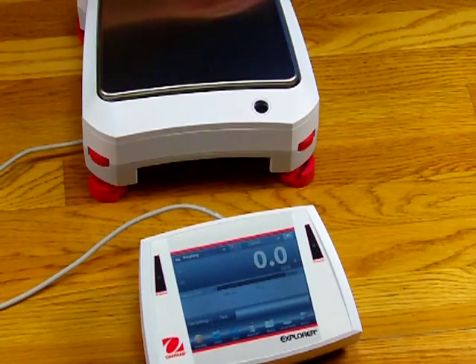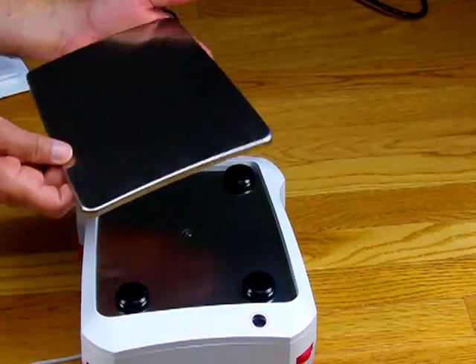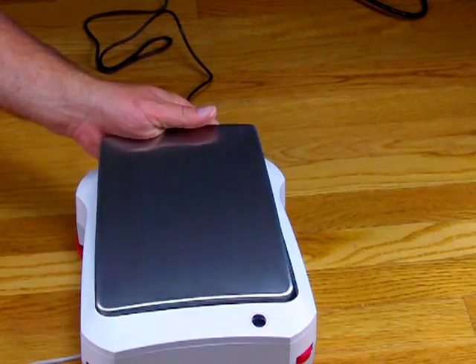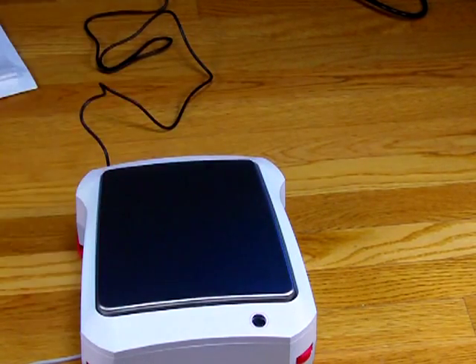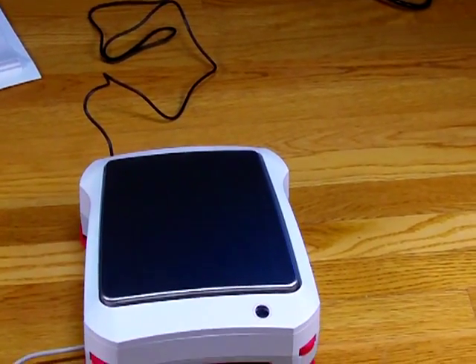Let's talk about the weight pan. This is the new design for Ohaus balances today and in the future — it is a trapezoid design. The front of the weight pan is wider than the rear. Ohaus says most future models will have this design, already implemented in the Ohaus Scout series and the new Navigator series. Ohaus's goal is that anybody walking into a laboratory sees this trapezoid design and right away recognizes this is an Ohaus product.